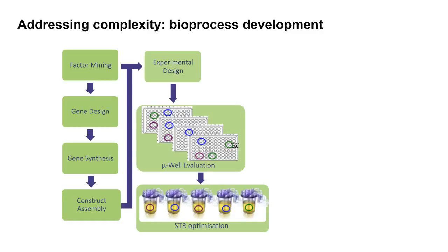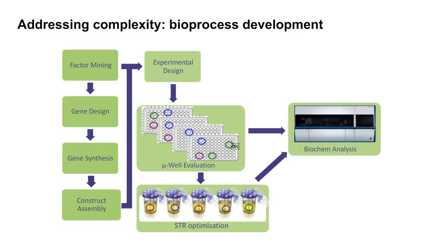And in turn, all of the data coming out of these has to go through an entire bank of omics pipelines, everything from looking for various levels of analytes to sequencing to understand genetic drift that's occurring in these organisms. And of course, ultimately, it's moving up into stirred tank reactors, steel, and confirming that the models are successfully transferring between these different environments.